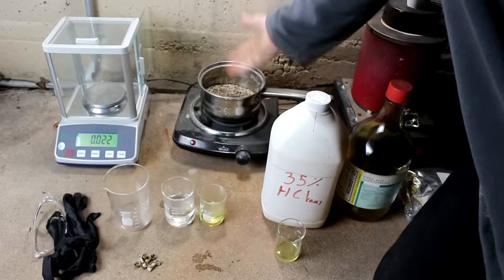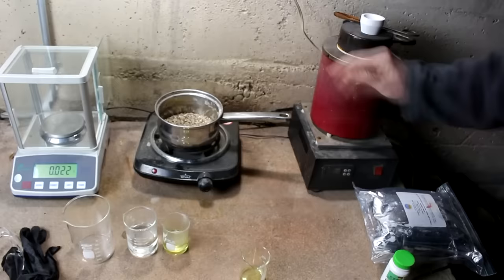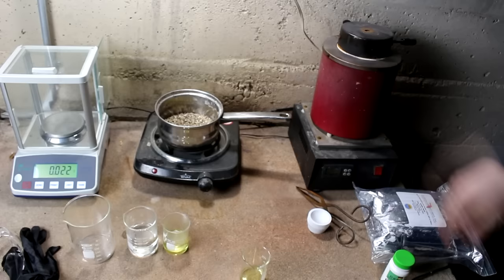I have a hot plate here to warm the reactions and speed things up. Not strictly necessary, but it will save literally days. I've got a pan here with some gravel to dissipate the heat so I don't break my glass. And of course I'm going to need a way to melt the metals, so I've got a little furnace here that can get up to 2,000 degrees Fahrenheit, a melting dish, and tongs to get it in and out of the furnace.